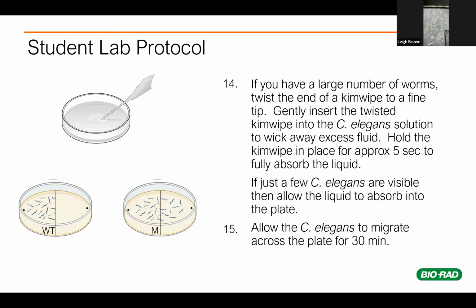And then people usually ask if you lose some worms in that. Yeah, you do. So if you have a situation where your students have subcultured the worms, we subcultured for you guys, but they'll subculture as a lab activity, and they don't have much of a worm pellet at all, maybe don't have them suck away the extra liquid. You want to make sure you have enough worms to see. But in this case, we have gobs of worms.